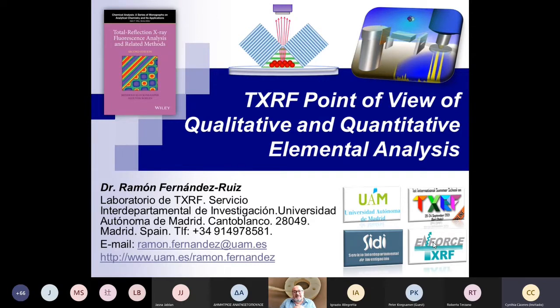But this question is very big and would take a very long time to explain correctly in depth. So we have only a limited time. The talk will be centered on some ideas that for me are really important and that my experience says are necessary to take into consideration for a good practice of TXRF.